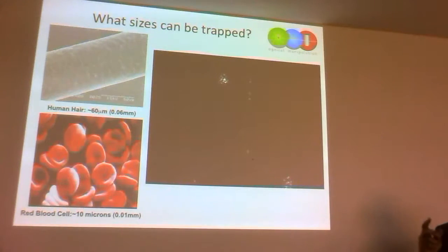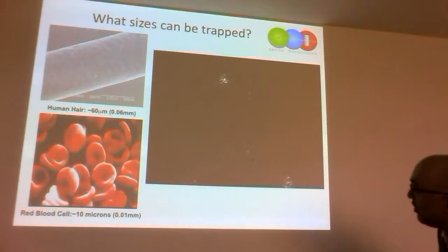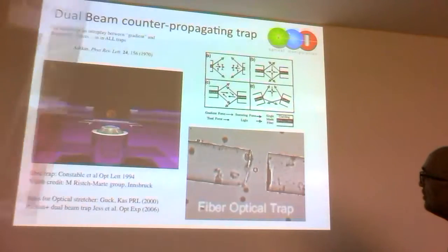Now, here, the force isn't just the light bouncing off the droplet. You say, hold on, Kishan, you're cheating. Hold on. Some of the light goes through that droplet, doesn't it? It's transparent. It's made of water or some other chemical. I bet some of the light's refracted, and you're absolutely right. So there's another process going on. It's not just bouncing like light off a mirror. That was just there to give you the basic principle. But that's what one can do by using light and pushing it.